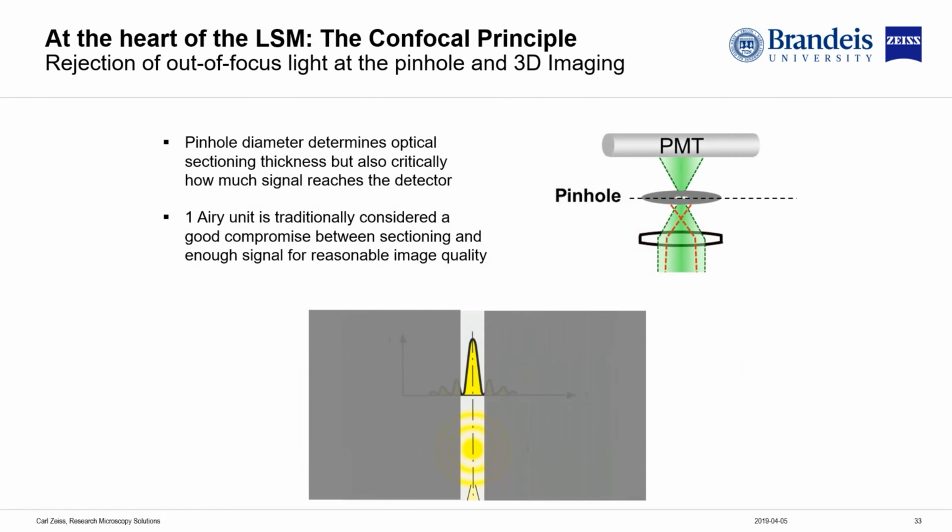If we could close this down even further, we could get an improvement in resolution, but we really throw away light at that point. And for people doing materials research or in industry, you can maybe get away with that. But for biological samples, really, you don't have the luxury of losing that much light.